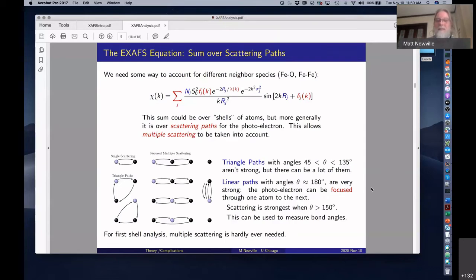But you can be consistent. In fact, if you do temperature dependence, all of those things sort of fall away, more or less, and you can be quite consistent in getting a good change in coordination. I hope that also helps. Mm-hmm. Yeah, at least you will have more experimental points that will allow you to increase the parameter space.